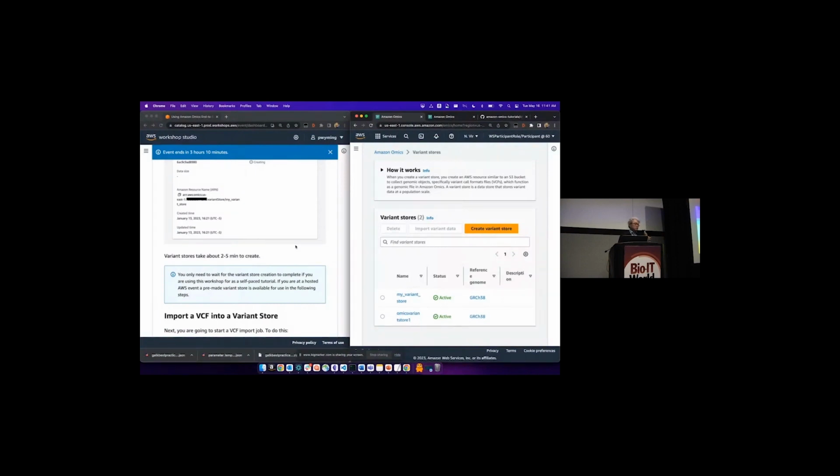One of the main things we're doing here is the ETL, and a lot of people are curious about how workflows plug into that conversion. To do that from a workflow, you could add a step that makes a CLI call to the API. So effectively doing what you're doing in the console, but from a command line.